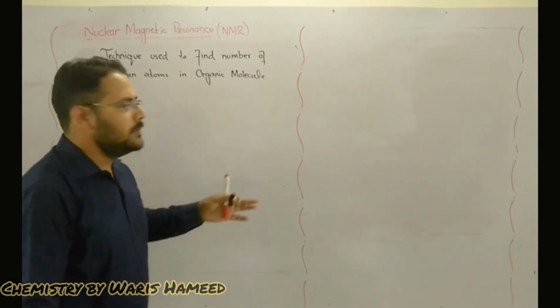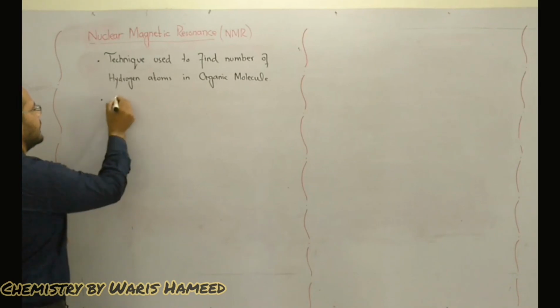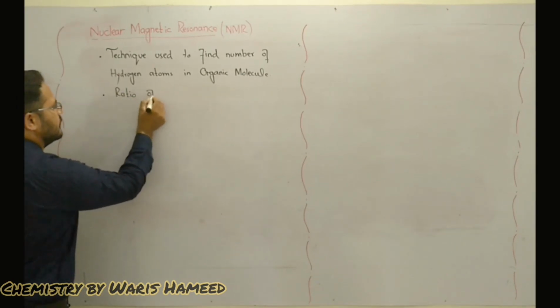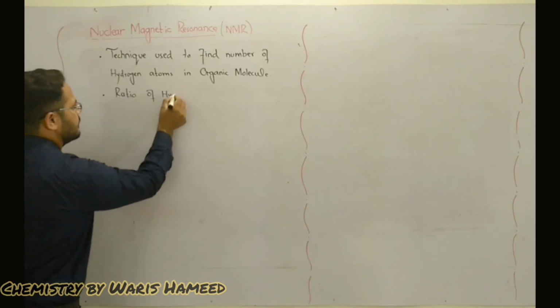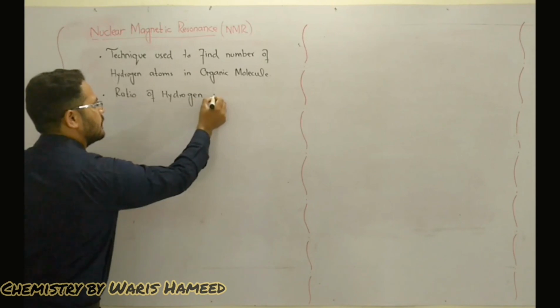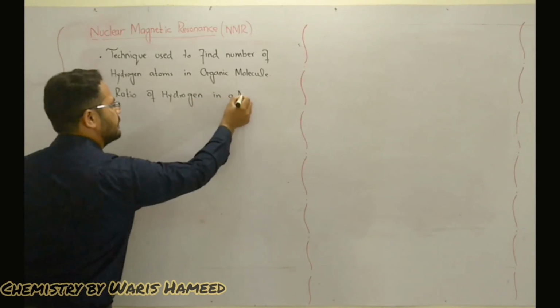It can also be used to find the ratio of hydrogen in a molecule.